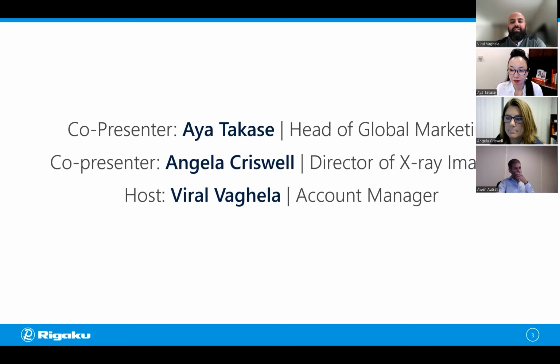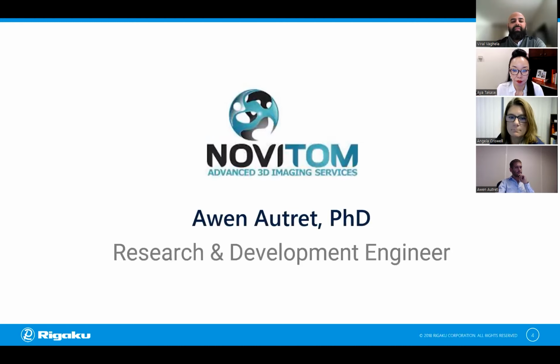The best way to learn something new is talking to an expert. Our series will cover various topics and will be joined by industry experts to help us better understand CT techniques. Today, we want to welcome Dr. Awen Autret as our expert. Awen is an R&D engineer with NOVITOM who helped design their simulation program for X-ray images. He'll be discussing how to optimize data acquisition parameters without having a CT scanner.